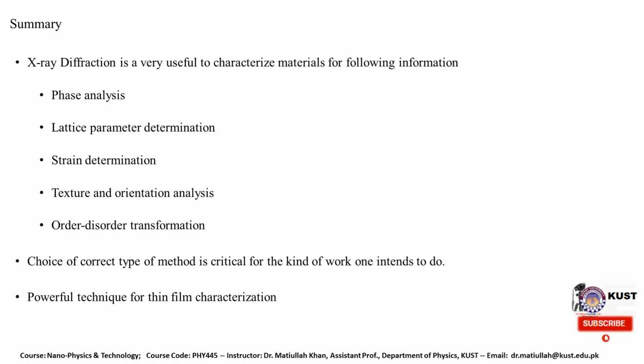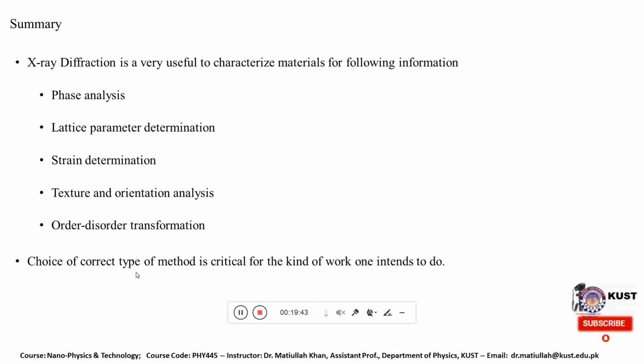So we have powerful tools for that. This is what we have about X-ray diffraction, and it is very interesting because we can get very useful information using a very simple method. From this method we can get especially the lattice parameter and the phase, because some materials exist in different phases. So we can also find the correct phase from the pattern obtained from the X-ray diffraction technique, and then compare that with the standard JCPDS cards. So this is today's lecture. Thank you very much.